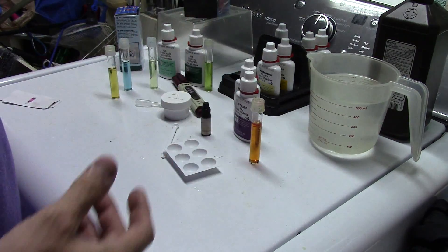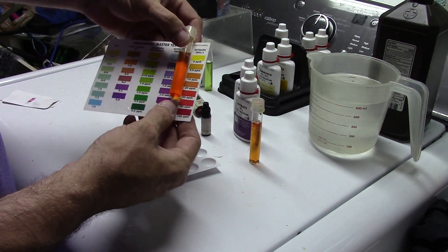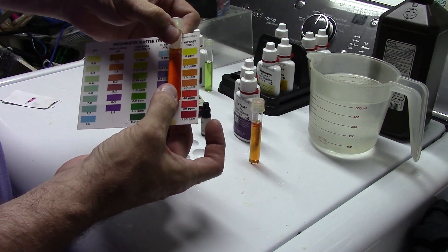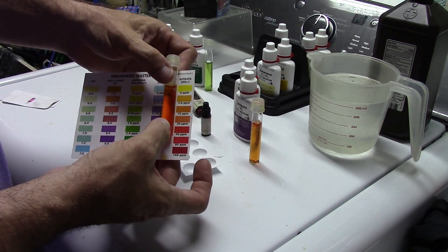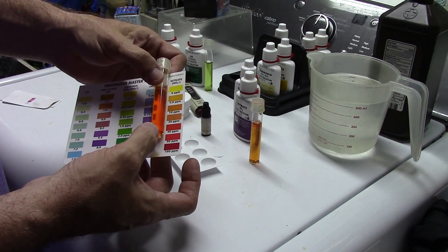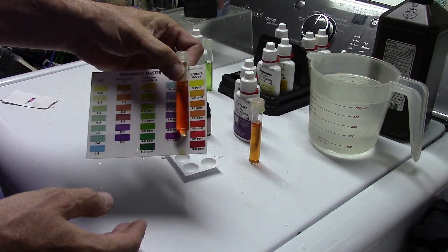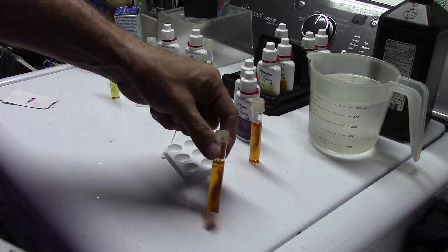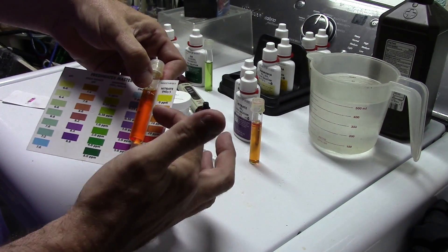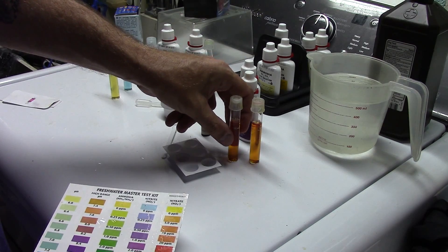I do want to make a note that it is important that you always hold the vial against the paper card. You want to get it somewhere with a nice bright light shining on it, but you don't want light coming through from behind it — so you want it against the card. I have not only been told this by professionals, but I called Mars Industries, who is the parent company to API, and according to their customer support this is the correct way to do it. Don't hold it up to a window or against a white background; hold it against the card and match the color.